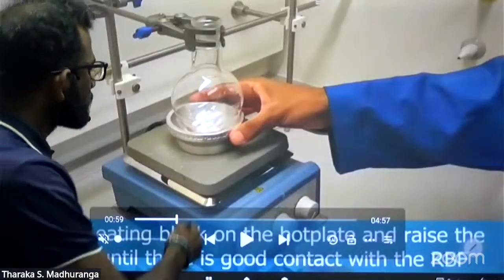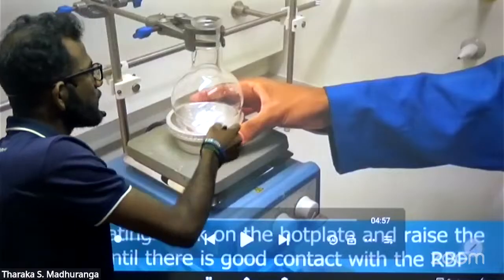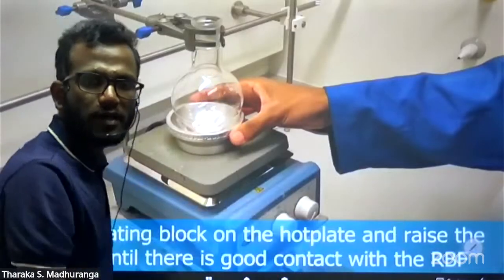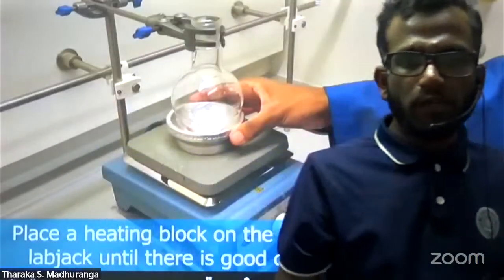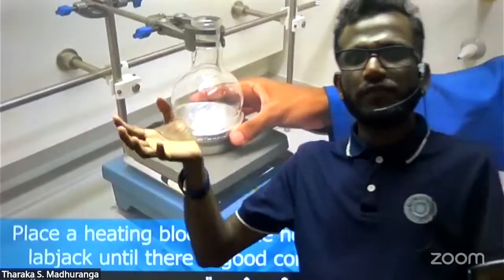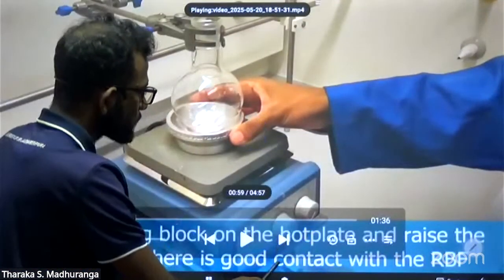First, this heater is heating. After that, this part heats and this heat energy is supplied to the solvent chamber. Because the solvent chamber is round bottom, therefore we have to use a supporter.